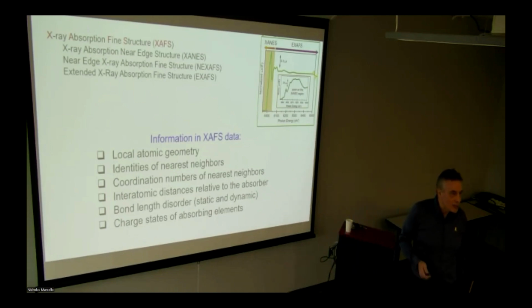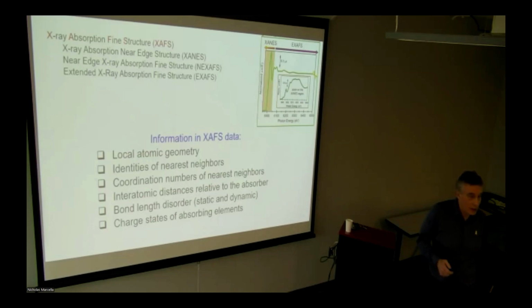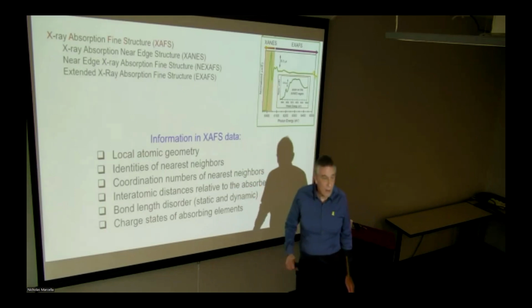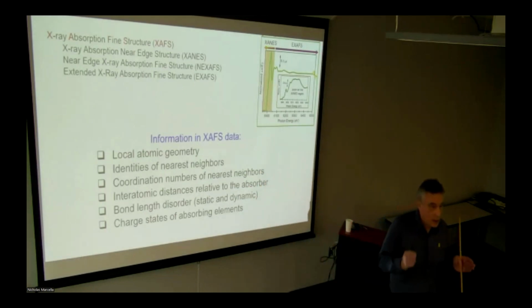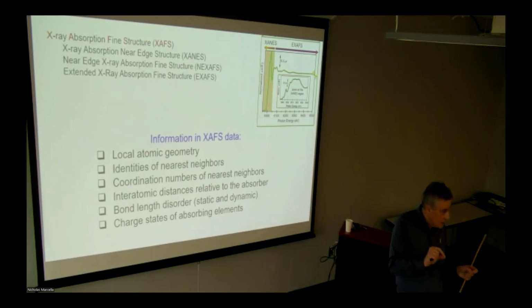So it's very important to understand what the limitations in the theory are that allow you to obtain these answers, because they are not hardwired into the material. They depend on the approximations. For example, the disorder may come from two sources. If you have a periodic lattice, there is no interatomic disorder because all atoms have the exact same distance to the neighbors, right? And that's what we will see by techniques which are not very sensitive to the local deviations from that lattice.